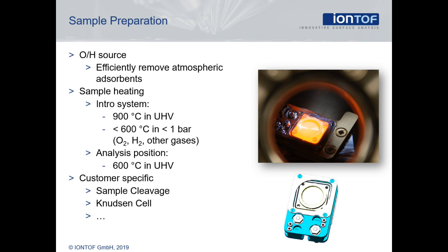Many other sample preparation techniques can be adapted to the pre-chamber of the QTAC 100. For example, sample cleavage to expose fresh surfaces of glass or other materials in vacuum. Also, thin film deposition can be performed to prevent an air break between deposition and analysis. Ultimately, the instrument can be coupled to deposition systems or other instruments to form an integrated cluster tool.